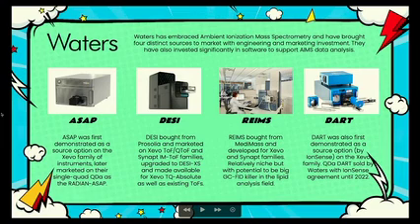First demonstrated, as I said earlier, with the Xevo family, and you can get the ASAP probe if you want to do ASAP with a Cyclic or an MRT or something. You can do ASAP on that. But where they've really developed over the last 2 or 3 years is with the single quadrupole Radian ASAP instrument, and it's an ideal screening instrument, really, really nice.